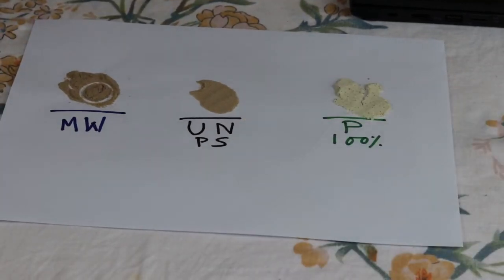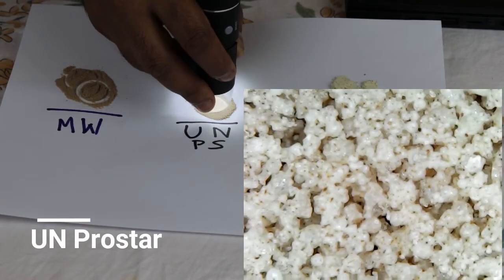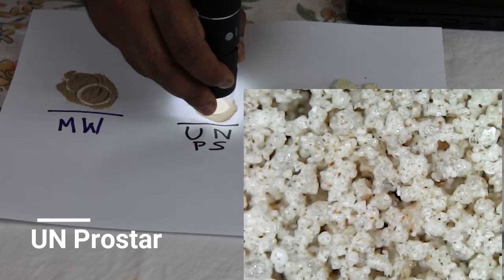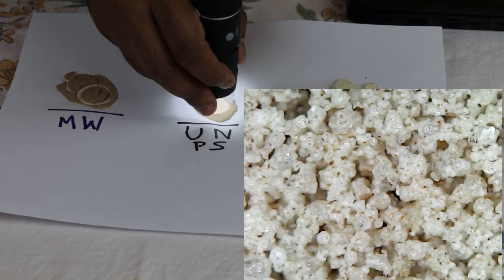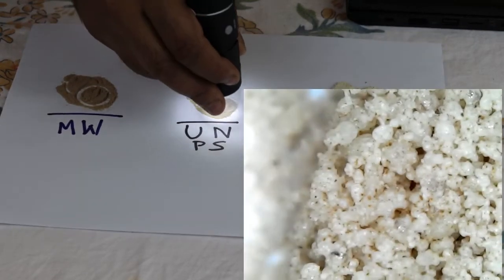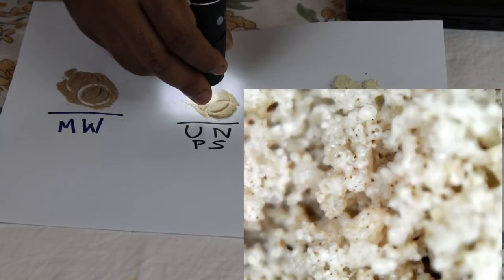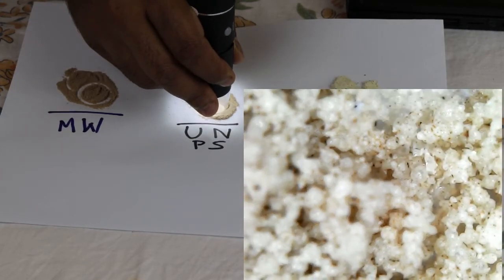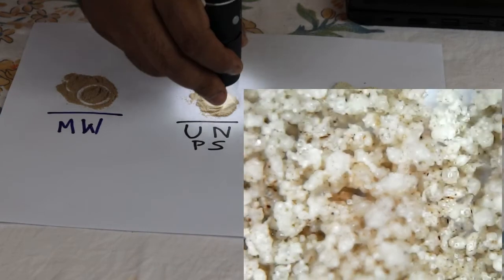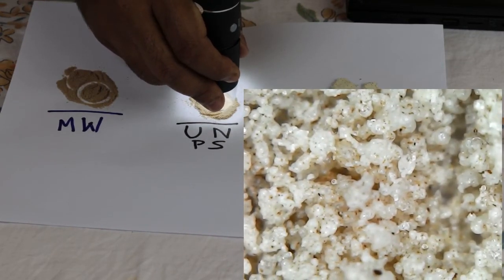Alright, that was Muscle Whey. Now, moving on to Ultimate Nutrition Prostar, which also has a really clean structure, and it's much cleaner. That's understandable, because it doesn't have as many additives as Muscle Whey. It doesn't have ashwagandha, it doesn't have prebiotics, so those things are not there. It's just a simple blend with sucralose. That's why it's almost the same as Muscle Whey, except for a few of those yellow things missing. That's what I think. It's nothing much. It's just as simple as it could be.